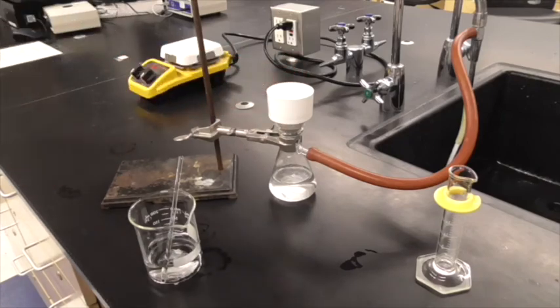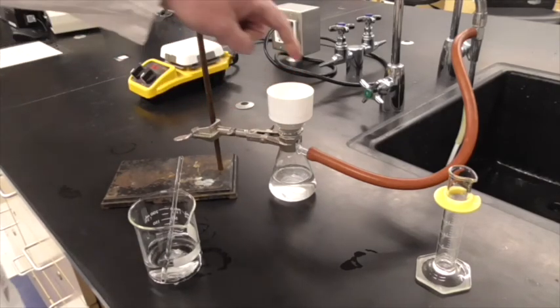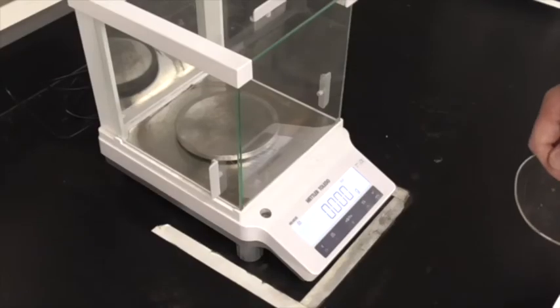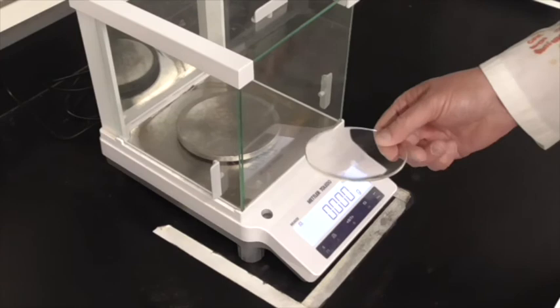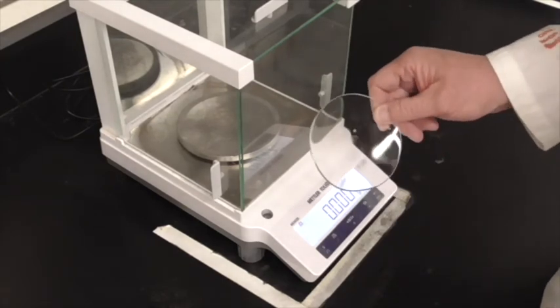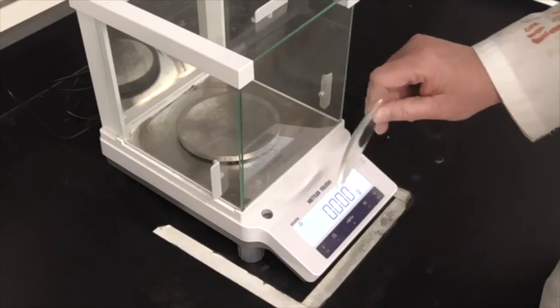Okay, give that a couple minutes, and then we're going to come back and we'll take the filter out and put it on a watch glass. Alright, so I'm here at the balance because after doing the filtering, I've decided that I want to put the filter on a watch glass to let it dry overnight.